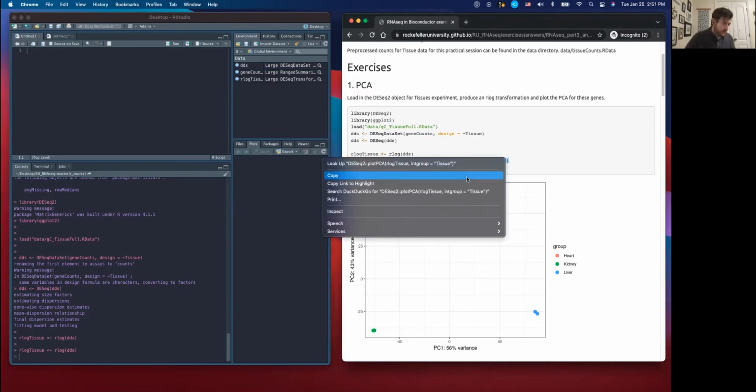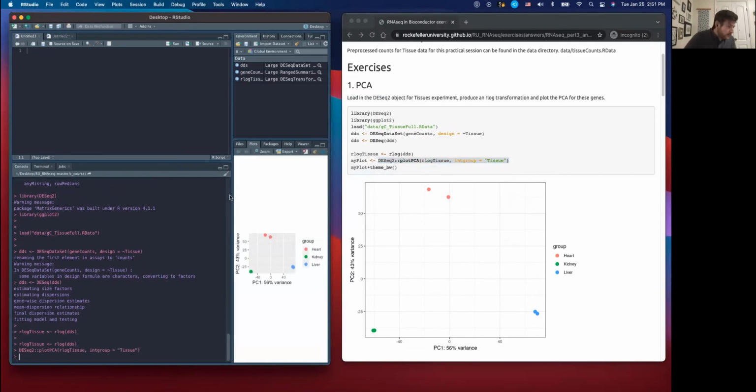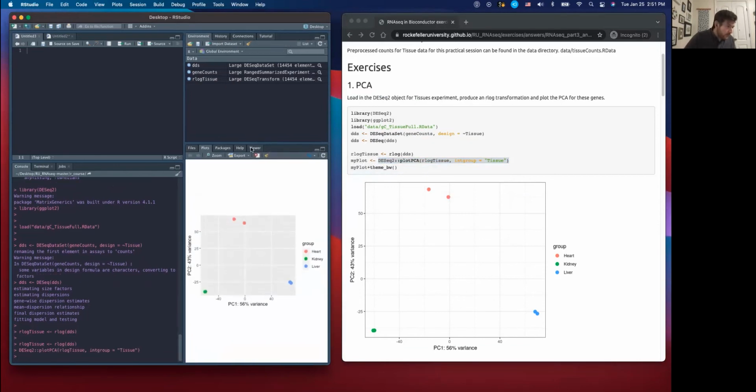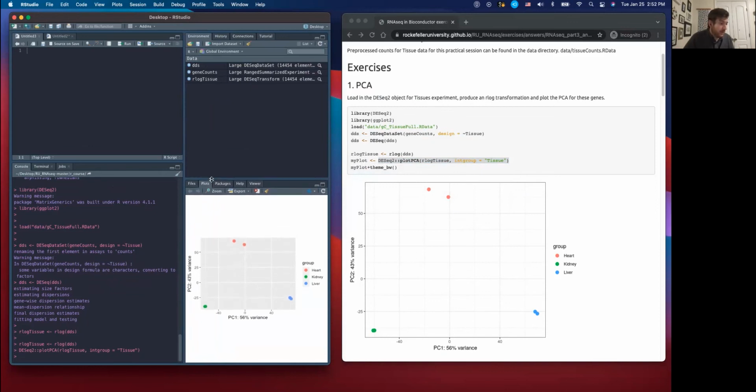Let's grab that. Okay, so for those familiar with ggplot, this is a ggplot. If you're not familiar with it, it's probably the best graphing package there is for R. It's one of the main selling points for people to use R. It's part of the tidyverse. We have a course about using ggplot, and I'd encourage you to check that out if you're unsure about how to make plots look nice in R. It's a really good set.